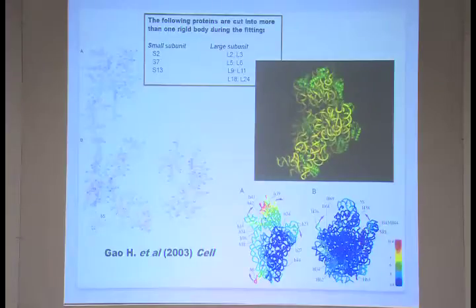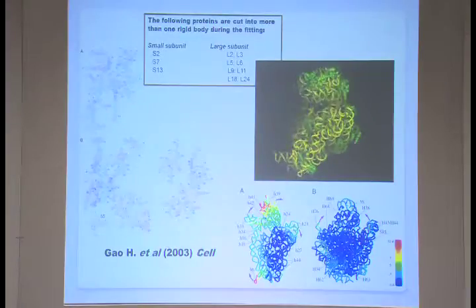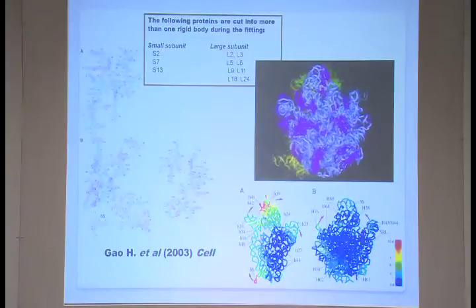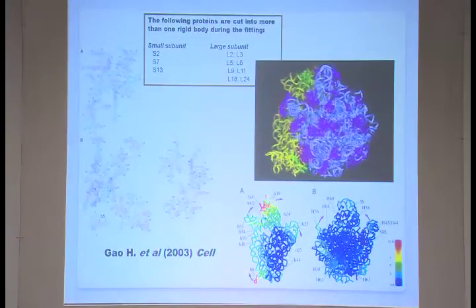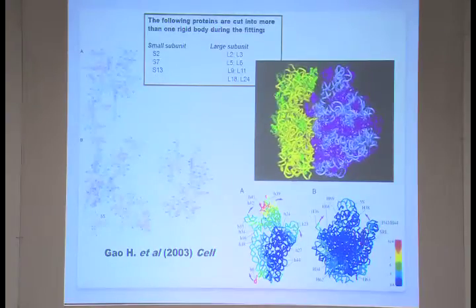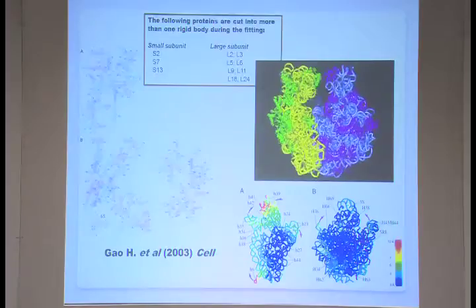modeling. And then it really shows the kind of B factor of which regions are more flexible and which are more stable. The core regions are more stable, and then the 30S is more unstable than the 50S large subunit. So it's limited information you can get.